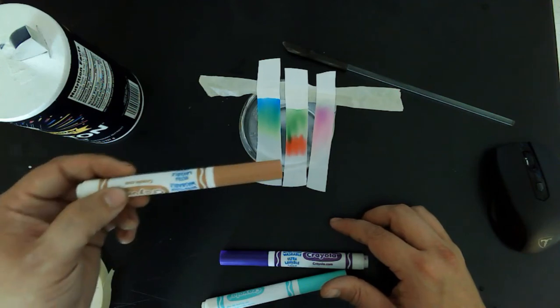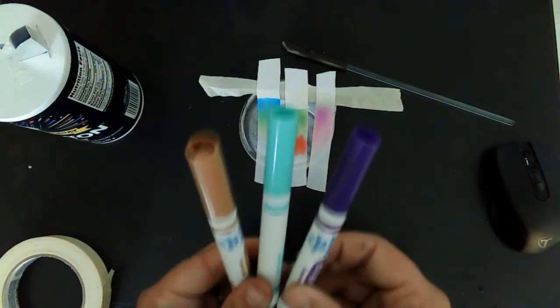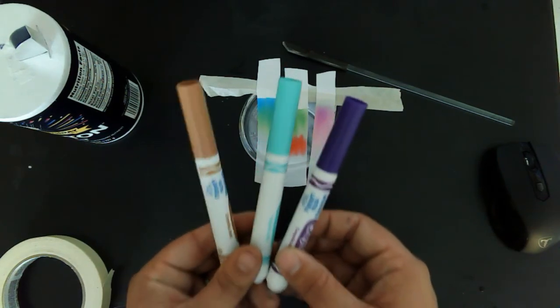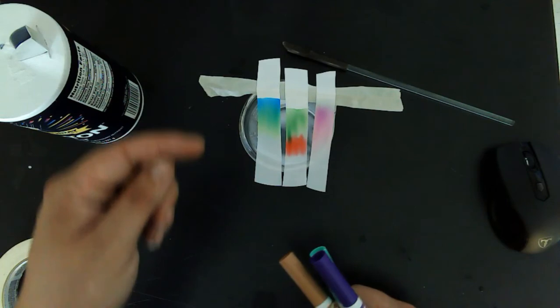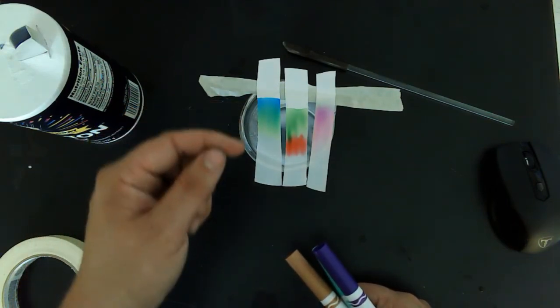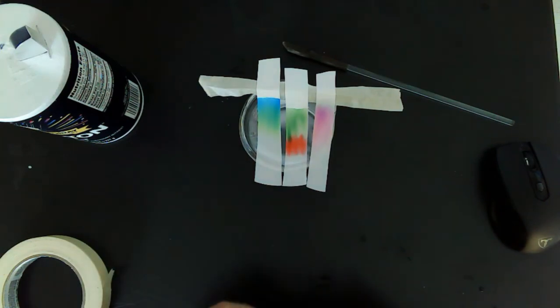So what we can see is that all three of these markers are homogeneous mixtures of different pigments, and we were able to separate their pigments, with the smallest molecule being at the top because it was able to travel faster, and the larger ones towards the bottom.